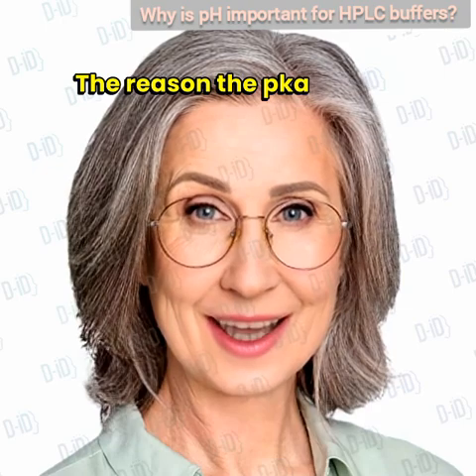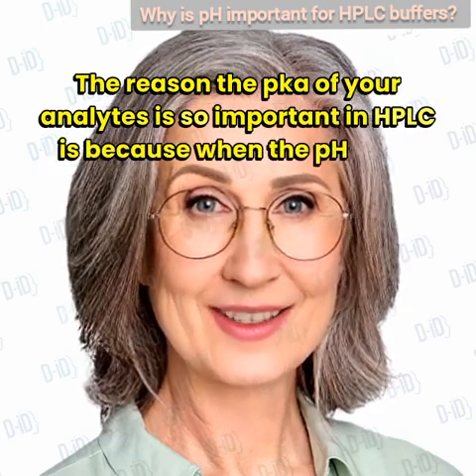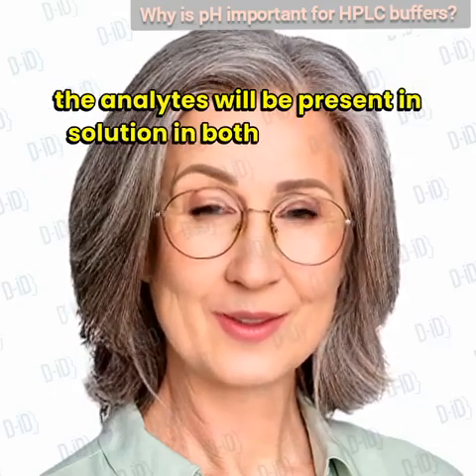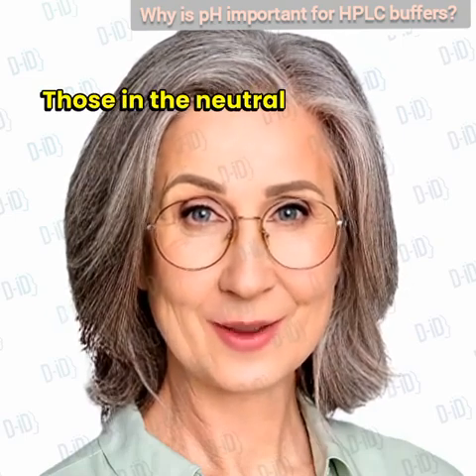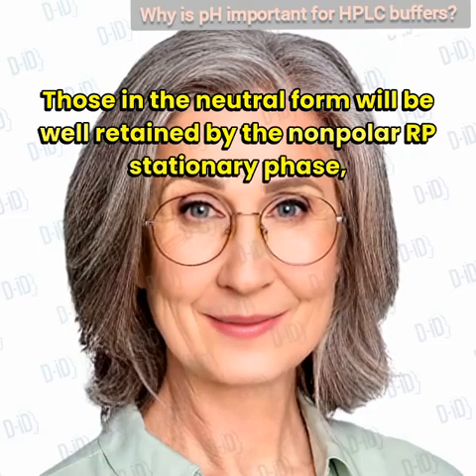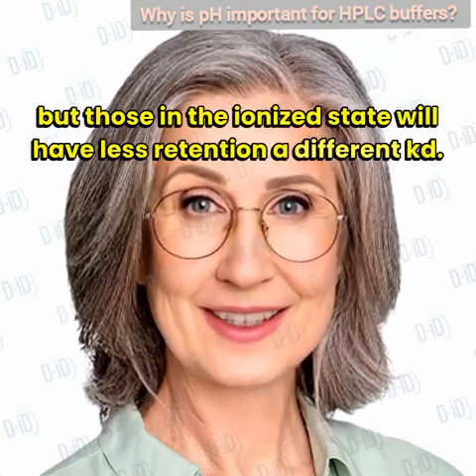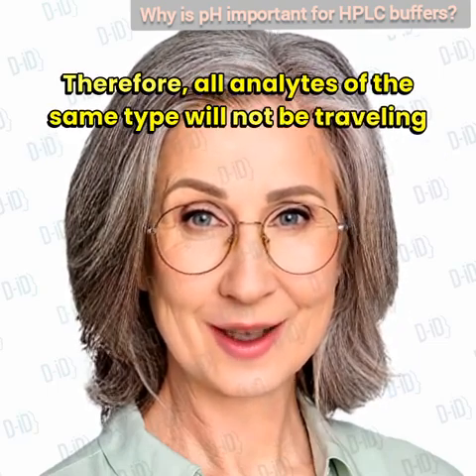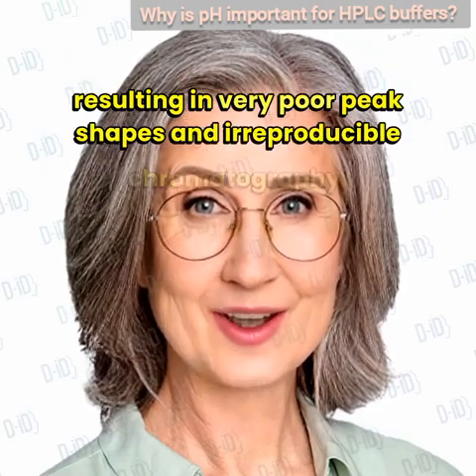The reason the pKa of your analytes is so important in HPLC is because when the pH is set close to the pKa, the analytes will be present in solution in both neutral and ionized forms. Those in the neutral, nonpolar, form will be well retained by the nonpolar RP stationary phase. But those in the ionized state will have less retention, a different Kd. Therefore, all analytes of the same type will not be traveling through the column in the same manner, resulting in very poor peak shapes and irreproducible chromatography.